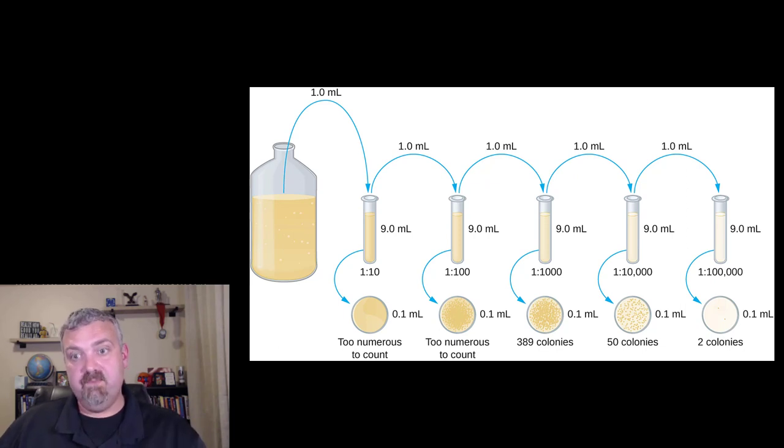Mix it up really well. Go back into tube number two and do the same thing again and again and again. So you're doing it one, two, three, four, five times here in this example.